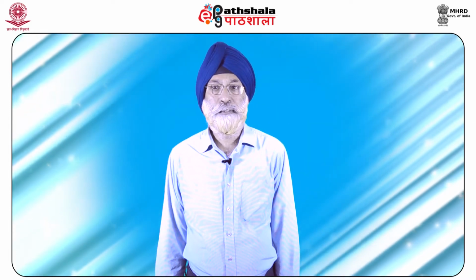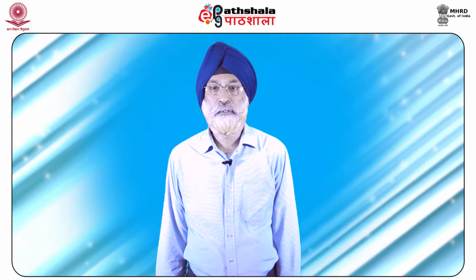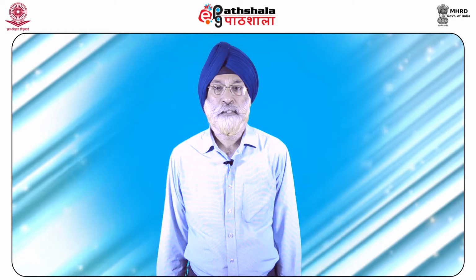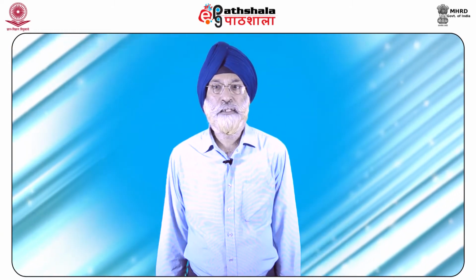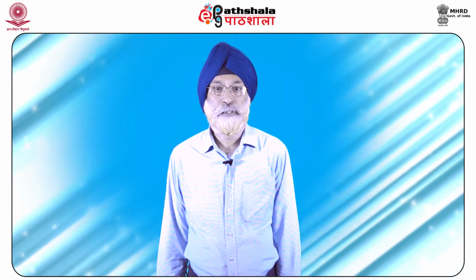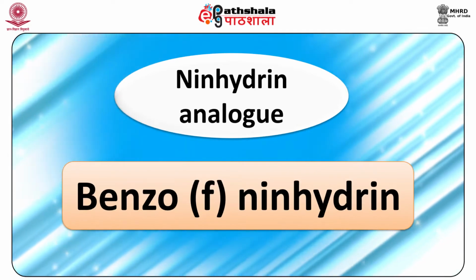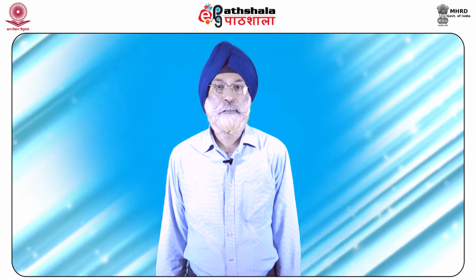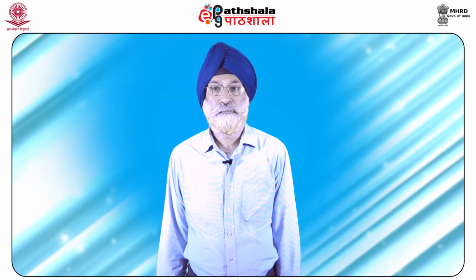It was anticipated that the derivatives of ninhydrin possessing diketonic functions would react with the amino acid content of sweat the same way as ninhydrin does. With several ninhydrin analogues, this expectation came out to be true. The most promising ninhydrin derivative is benzo-F-ninhydrin. This reagent develops green colored fingerprints with excellent resolution.